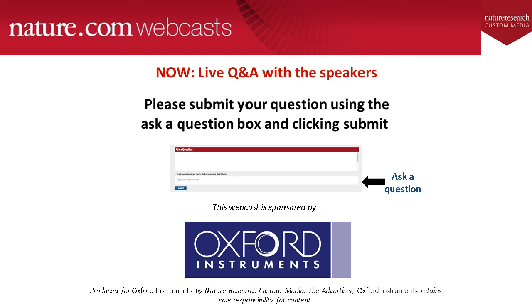Excellent. Thanks, Erin. And our next question asks, what is the largest solid angle achieved using these detectors in the SEM and/or TEM? The largest solid angle for the TEM is 2 steradians, and for the SEM is about half a steradian with these detectors.